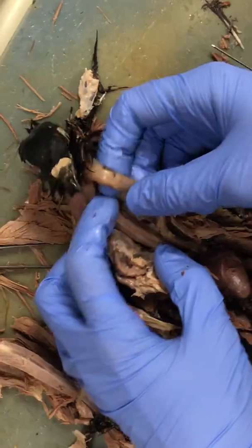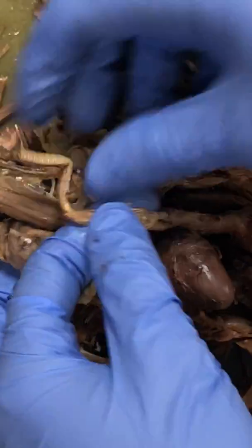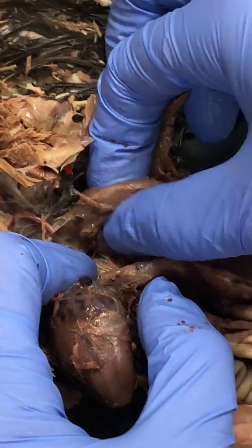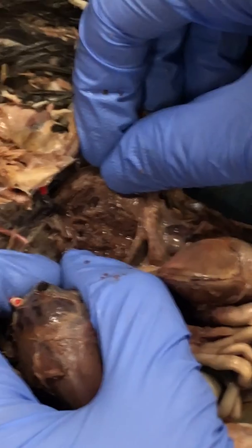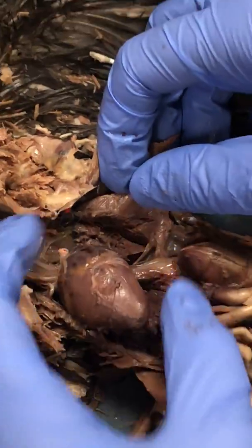Moving up, this right here is the trachea. The trachea divides into the bronchi, which are these two tubes, and then that leads to the lung, which is this tissue right here. You can cut it open and see that it's like a meshy network inside, and that tells you that's the lung tissue — the alveoli that make it up.